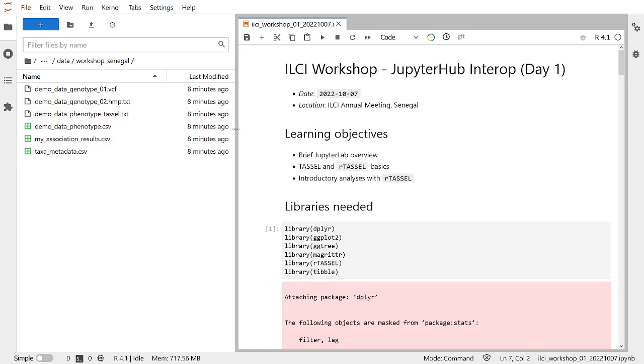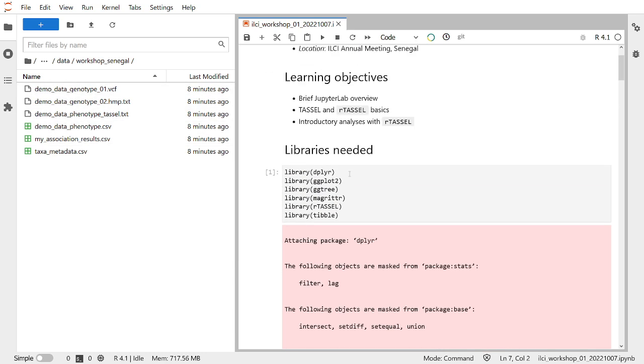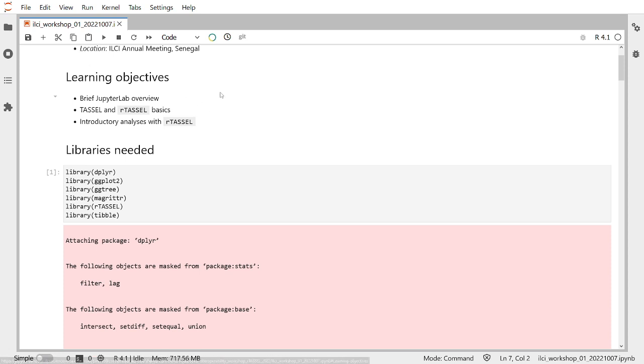You shouldn't have to really worry about going directly into each one of these different data directories, at least in terms of getting the data, because as we scroll down through this notebook, all of this material will be in hard-coded paths for you to follow. So yeah. And so again, this is a notebook.